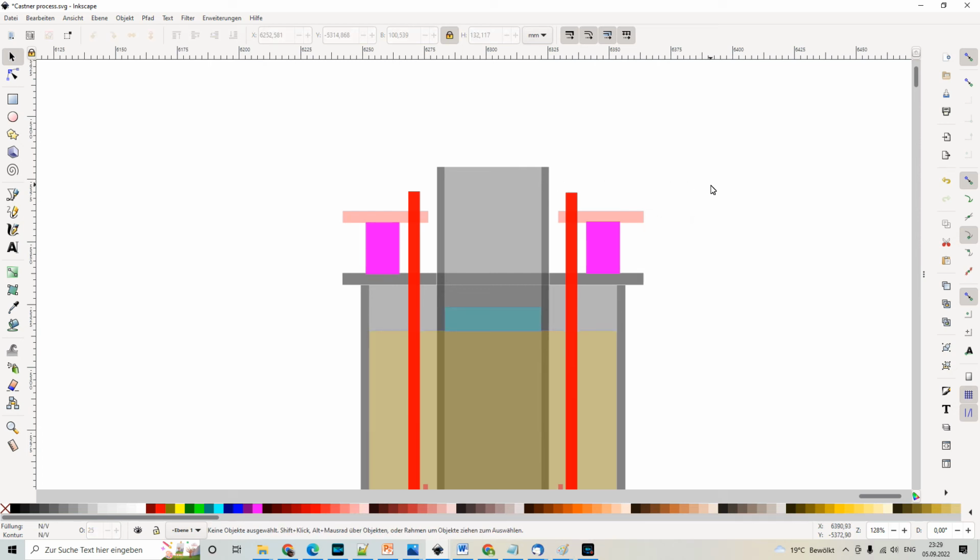So you can see the sodium globes appearing but also disappearing again because they are simply oxidized very fast. So in order to keep the sodium from being oxidized from the air circulation, once I had the idea to just put the lid on the tube in order to contain the hydrogen a little bit better to protect the sodium. Apparently, it did work to some degree, but at one point I had a major explosion because in this tube there was accumulating a lot of hydrogen, which I wanted, but in general, hydrogen and oxygen and high heat and sodium metal, it's not a good combination.